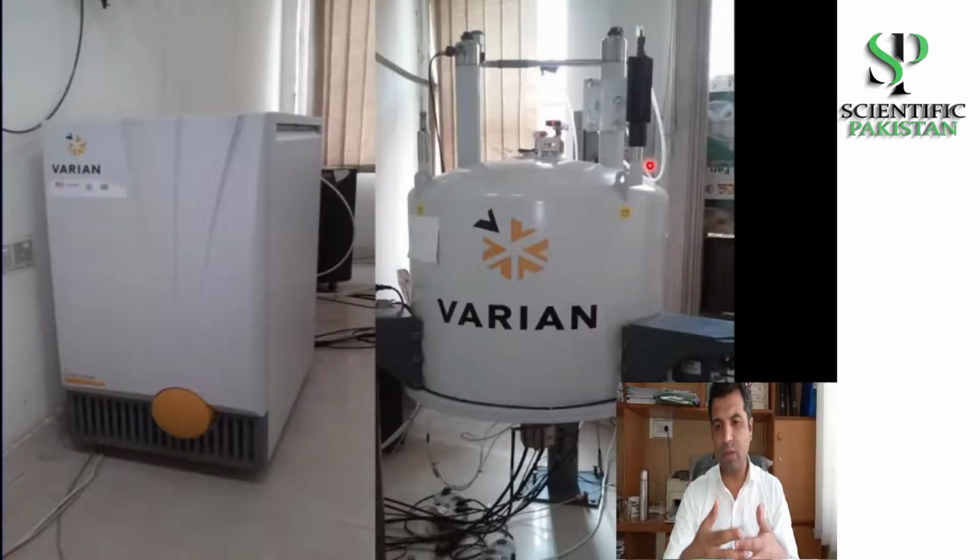So every week you have to refill liquid nitrogen because it's closer to the environment and it evaporates quickly. But liquid helium, because it's inside the inner core, takes 6 to 8 months to be refilled, right? And it doesn't have to go below the threshold level because that will quench the magnet. And it is connected to the console, which is then connected to the computer. So signals from this magnet go into the console, and then they are taken up by the computer.